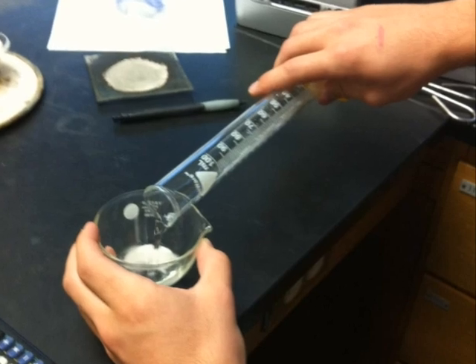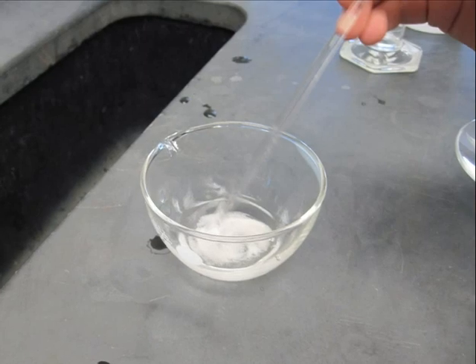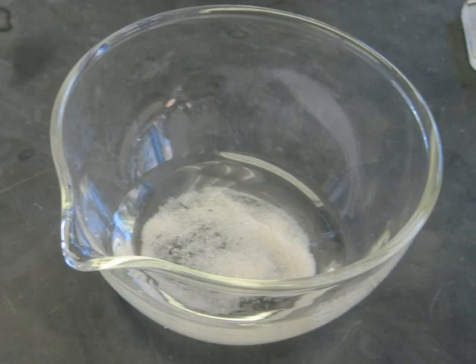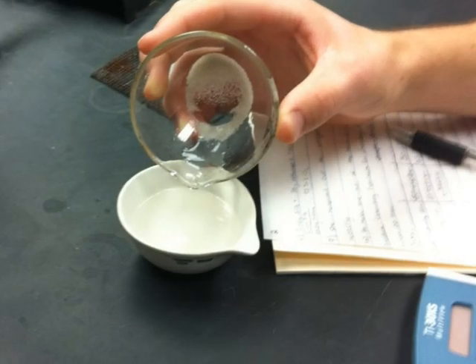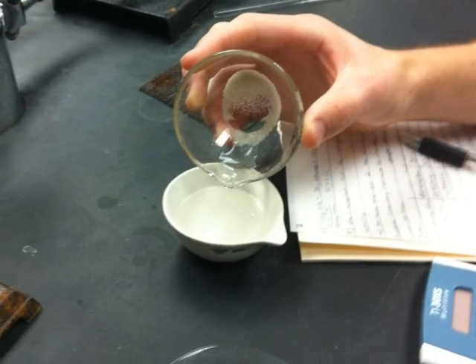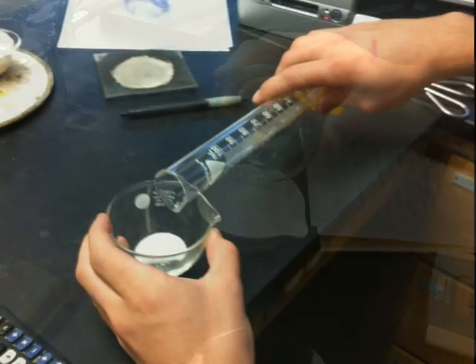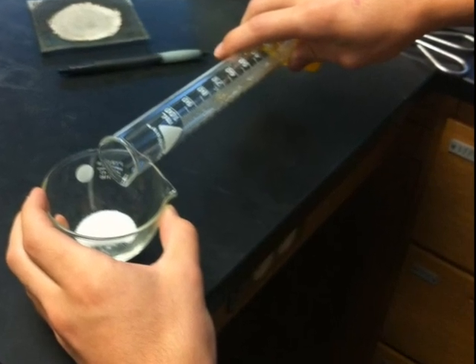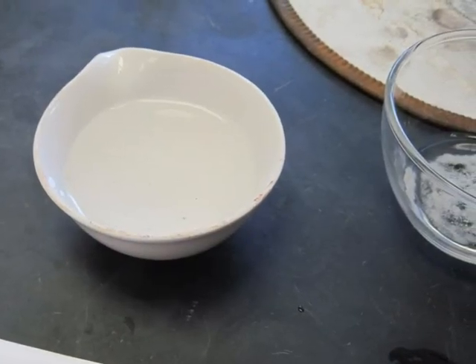Add water to your sample to dissolve the salt. Stir gently. The salt will now be dissolved, and the sand will remain in the solid phase. Carefully decant the salt water into a pre-massed ceramic evaporating dish to extract the salt from the sand. Wash the sand twice, adding the wash water to the ceramic dish. Your salt and sand have now been separated.